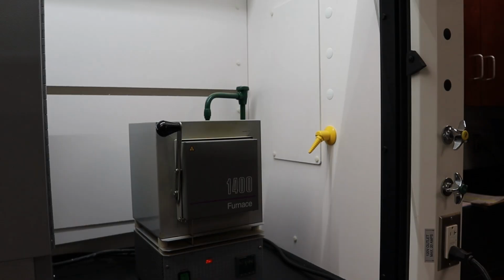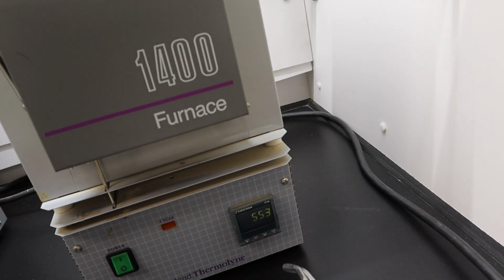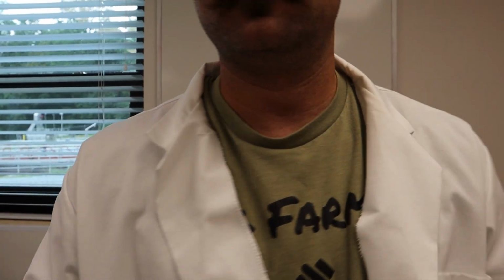All right, and we're gonna drop it in there. Yes, it is hot when you open the door. So, I don't know if you can see that on camera, but it actually dropped in temperature. It's starting to gain right back up to that 550. It's gonna stabilize out, and we're gonna let it sit in there for 15 minutes.